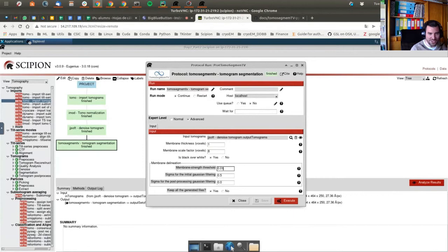Yes, I was going to go later with it. We have considered this membrane to be 60 Angstroms because they usually are 40 Angstroms in width, but someone wiser than me told me that if I consider the heads of the phospholipids, I don't know if I'm pronouncing them properly, it can be about 60. But with this pixel size, it doesn't represent a very high difference. Later this parameter will be critical and we'll discuss it a little bit.